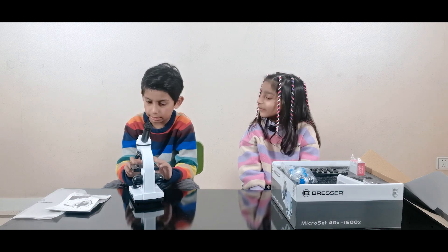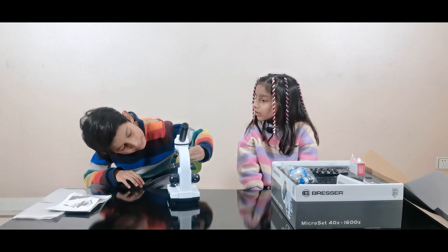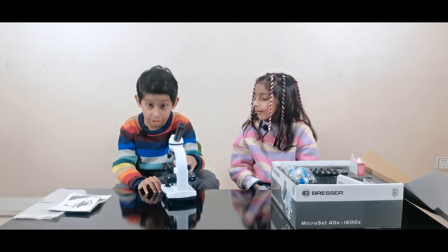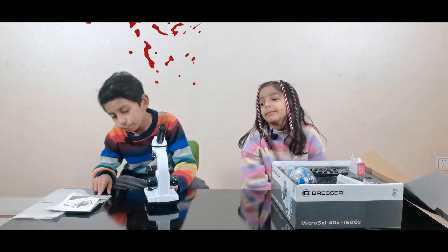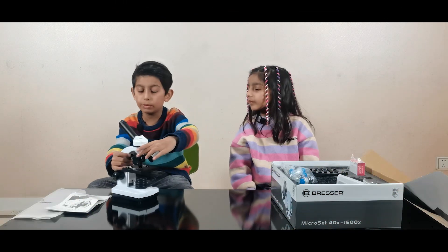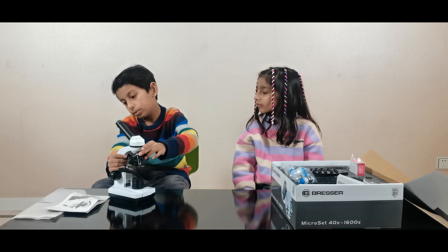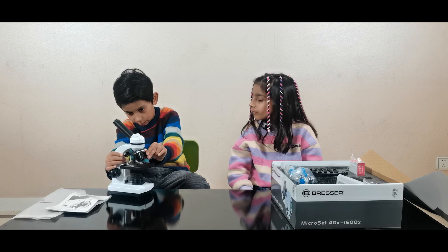And these three are lenses: the yellow one is 10x, the red one is 4x, and the blue one is 40x — so big! And this one is the movable nosepiece — movable, so we can change the lens.